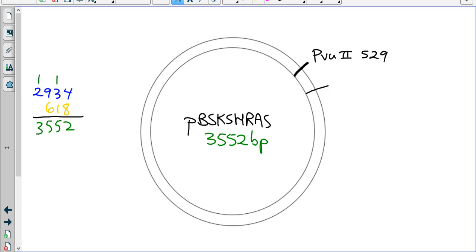Okay, nudge over, NotI at 670. So this 141 remains the same. 18, that's fine. That's close enough.